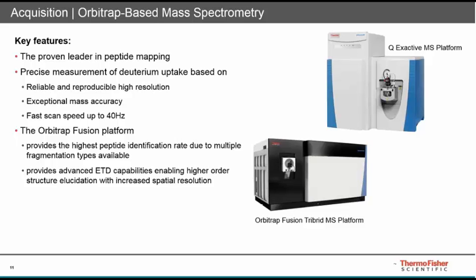So that would be time point 0. That can also be considered kind of a discovery experiment that serves for the identification of the peptides that are associated to the protein of interest. It's really important to assess that good sequence coverage can be achieved using that enzyme with the protein of interest. And for this discovery type experiment, MS/MS capabilities for high confidence peptide identification is essential. That's why we suggest a hybrid tribrid or Q Exactive platform to be able to cover the entire workflow, including this discovery type experiment.